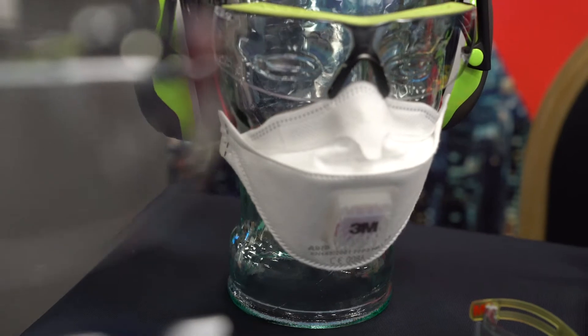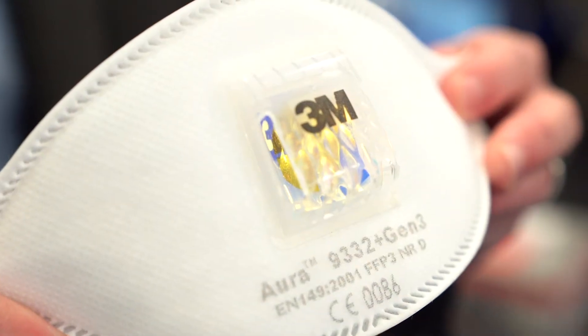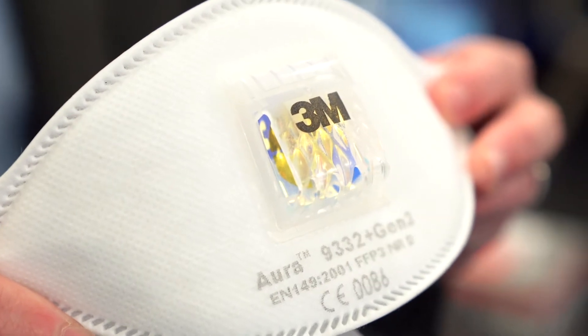3M manufacture our own filter material, and again we've improved that, which reduces the breathing resistance. But the real key addition to this model — if you can see that there's a sort of shiny foil inside there.